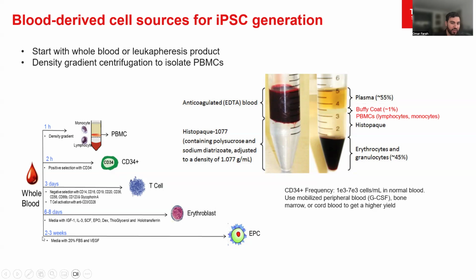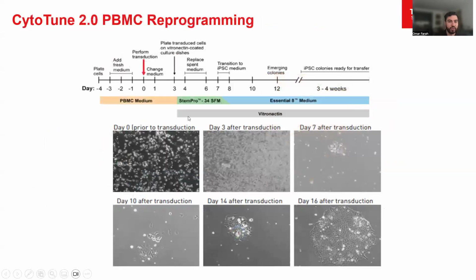And then I mentioned that from whole blood, if you are thinking about a particular method, mRNA for example, that doesn't easily support the reprogramming of suspension-based cells, you can derive endothelial progenitors as well in a monolayer in 2D, and then use those for your reprogramming as well. But once you have your PBMCs, right, you can start your reprogramming from that point.